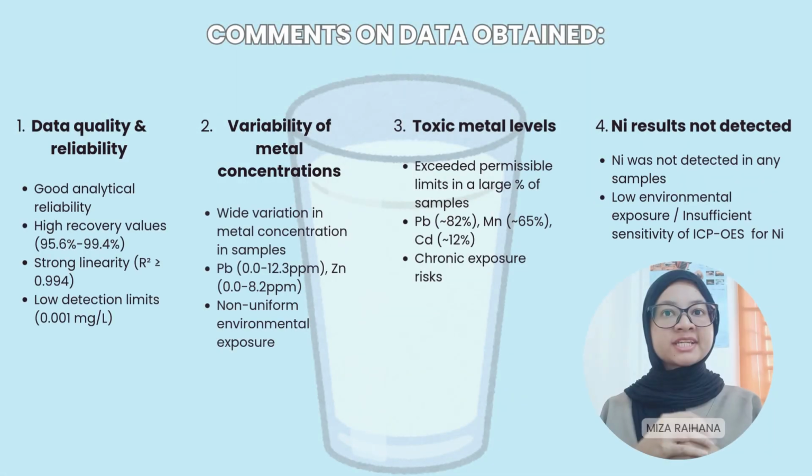I have a few comments regarding the data obtained from the article. Firstly, the data show good analytical reliability due to high recovery values ranging from 95.6 to 99.4%, strong linearity with an R2 value of 0.994, and low detection limits around 0.001 mg/L. So the result is considered trustworthy and not due to any errors.